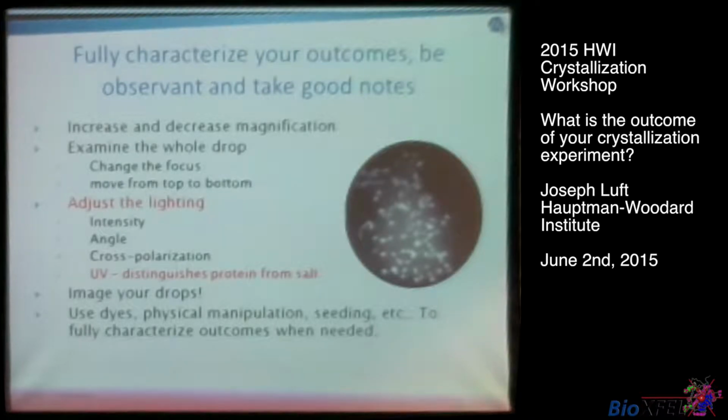A lot of things can happen between when you first set it up and the 1 week mark. Crystals can form and then go back into solution if the temperature changes in the building rapidly, or there's a protease present that's sort of chewing things up, and a lot of strange things can happen that can make crystals that were once there disappear. So imaging your drops is a really important tool, and doing it on a regular basis so that you actually have these sort of time-locked outcomes of your experiments that you can go back to see when things start to happen.